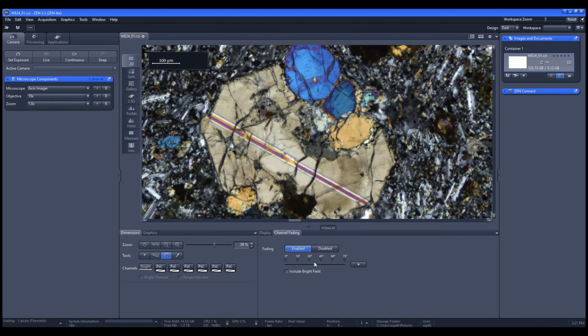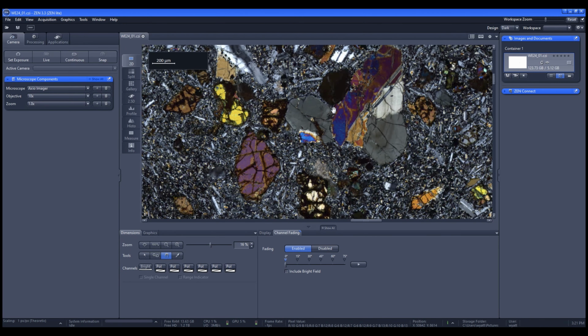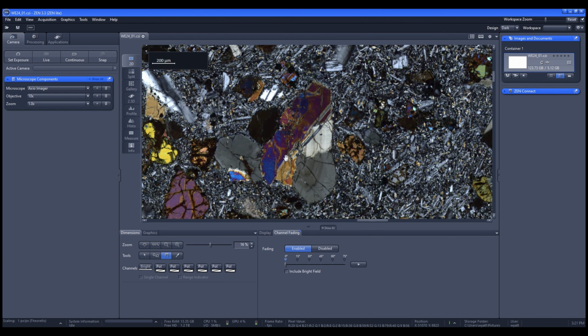This also has twinning. So the cleavage in this pyroxene is not really easy to see, and sometimes you won't always see cleavage. Even if a mineral has cleavage, you won't always see it. It depends on the orientation too, because the minerals in a volcanic rock like this are oriented all over the place when this thin section is cut in one plane, right? So you're going to see minerals in all kinds of different orientations. So it has to be lined up just right to see everything perfectly.